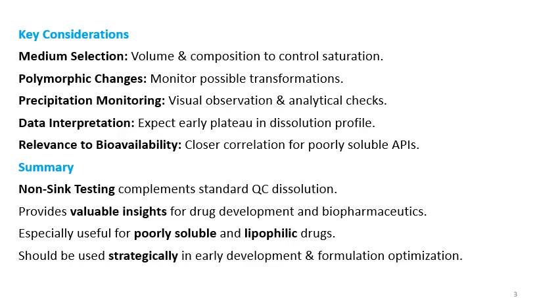Sink condition is required, but it is not mandatory. Some of the formulations are tested in the non-sink conditions. Sometimes you cannot get the 3x solubility, but you can get 1x or 1.5x or 2x solubility. So if it is below 3x solubility, the condition will be non-sink, but still you can use it.